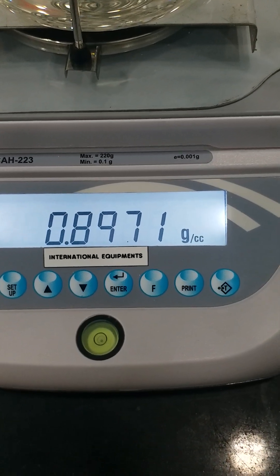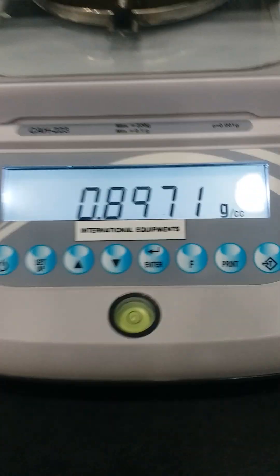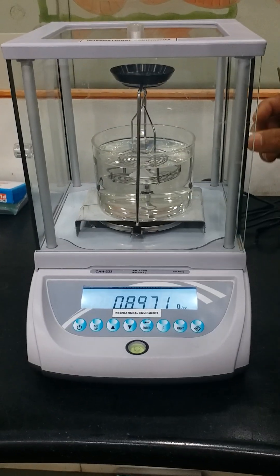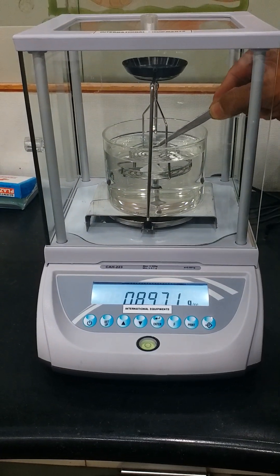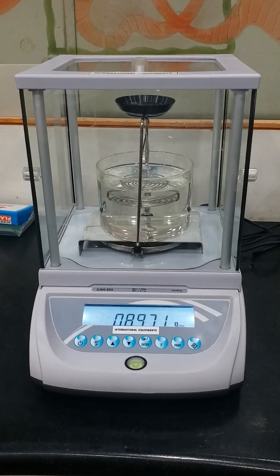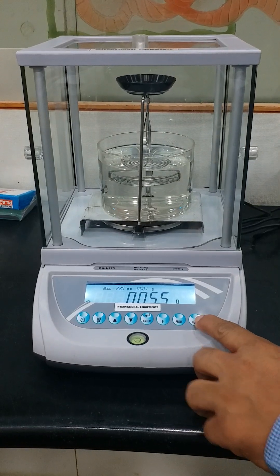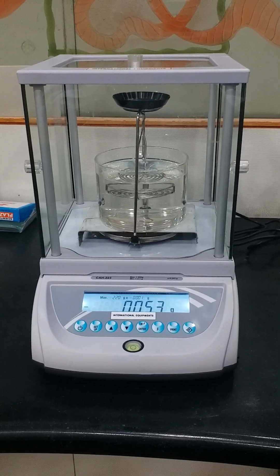Press Setup followed by Enter. You will be able to see the final result on the display, which is 0.8971 grams per cubic centimeter. The direct density result is displayed. Now remove the sample first from the beaker, close the glass door, and press the Tare to come back to the main menu. That's how we test the density. Thank you.